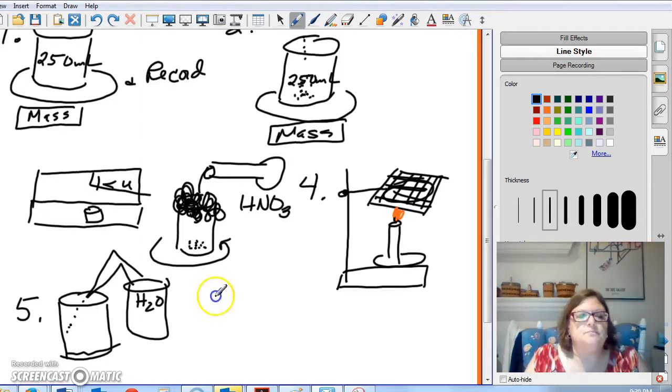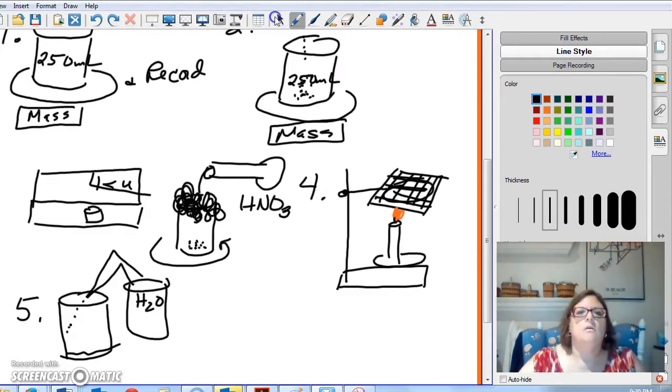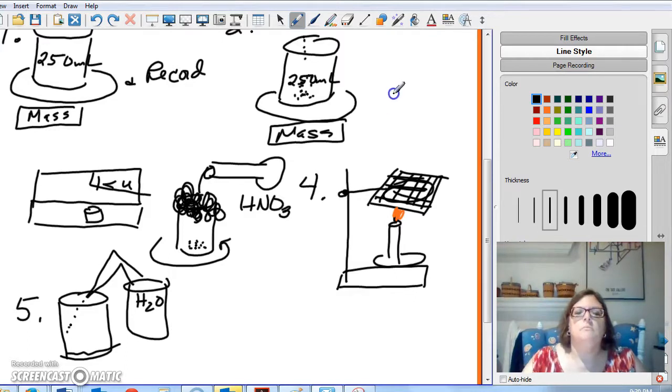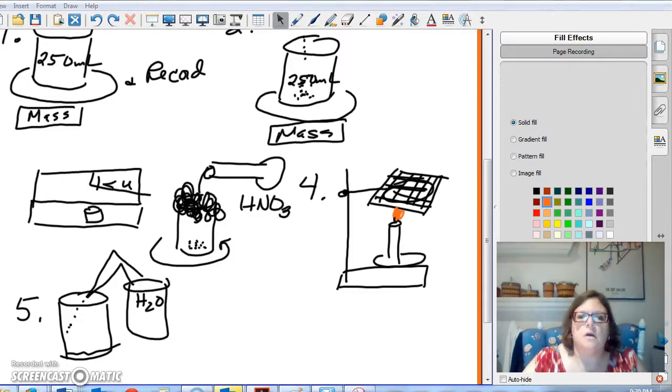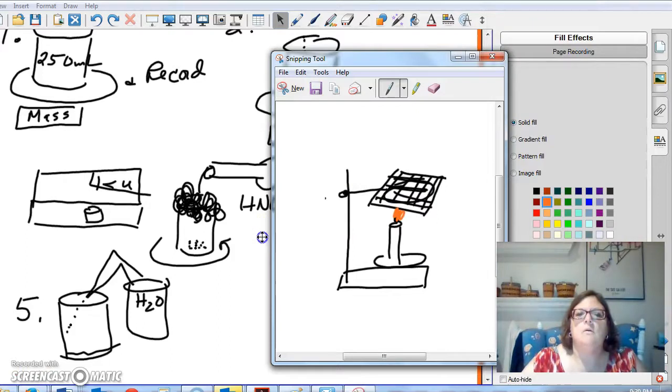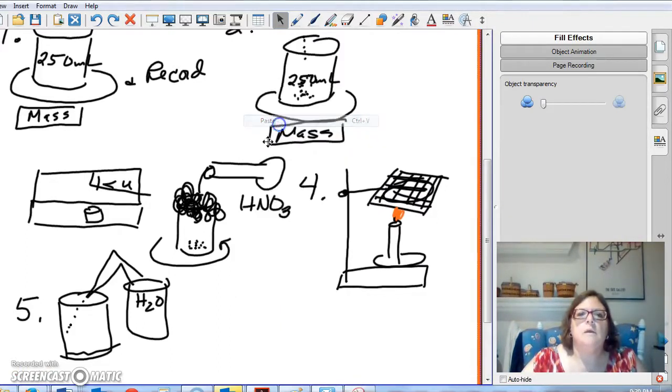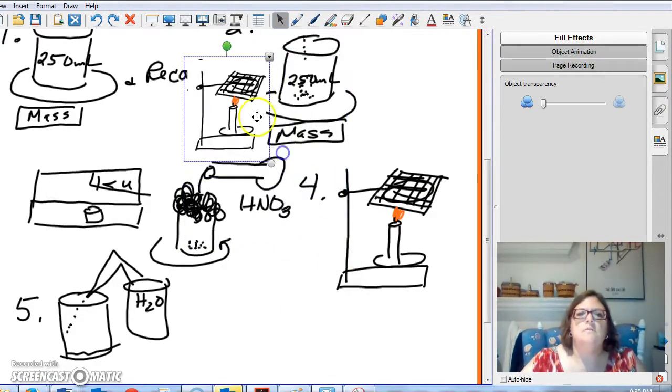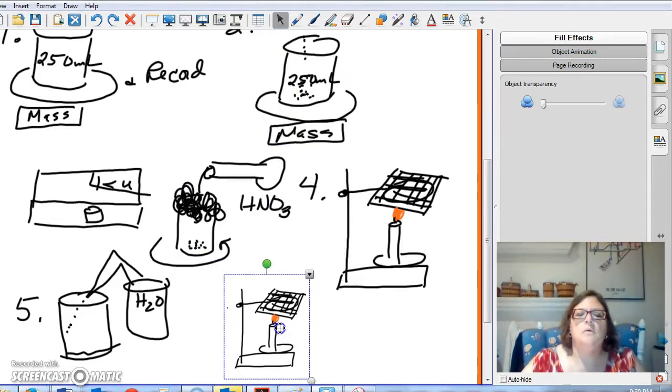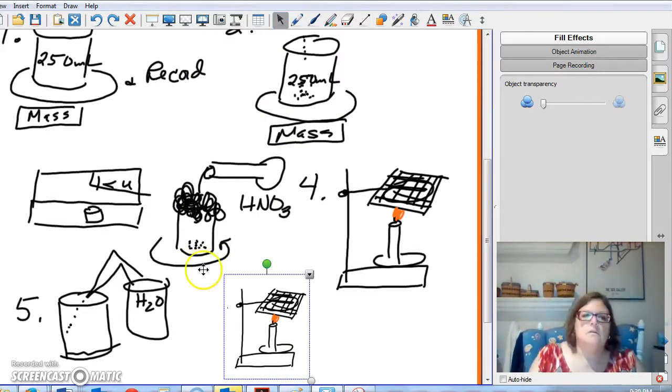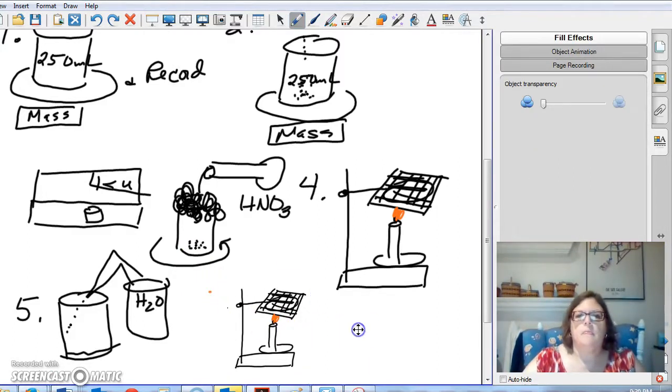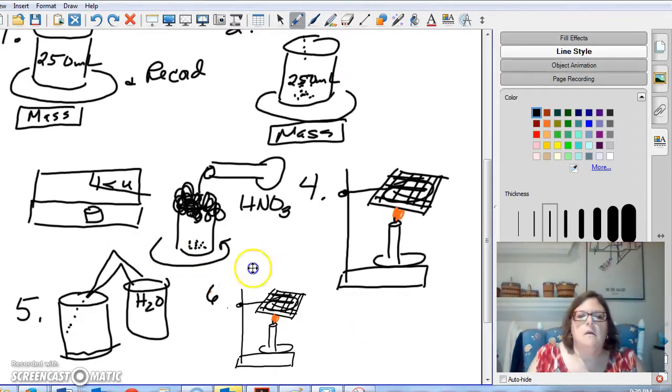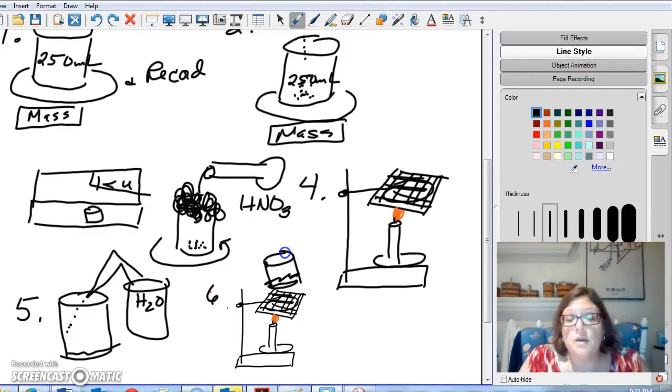Okay. So, now we're ready for step six. We're going to put our beaker onto our heating setup. So, now I really am going to just copy that. So, here's our heat setup for step six. All right. Come on. And we'll put our beaker on there and let it start heating. Okay. This is going to be hot. So, you're going to want to wear hot mitts.